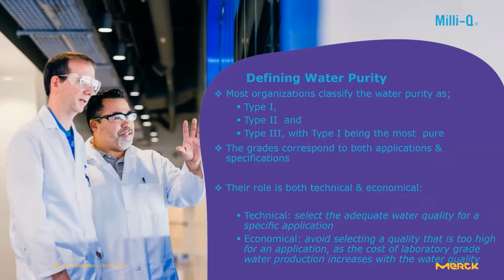Mainly it is to purify the water, and they don't just purify the water without regulations. We do have various organizations that define the water quality. If I can mention a few, we have ISO, or the Organization for Standardization. We also have ASTM, or what we call the American Society for Testing and Materials.